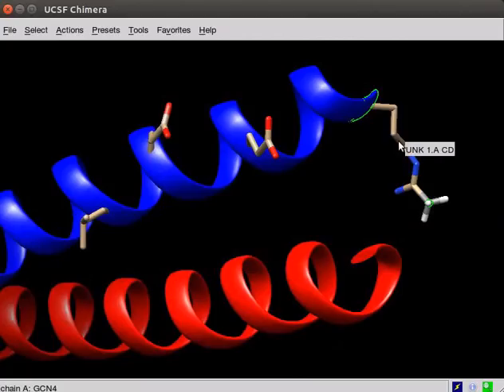Hover the cursor over the bond you want to rotate. Information regarding the bond appears in the atom spec balloon. To select a bond, place the cursor on the bond. Press and hold the Control key. Click the left mouse button. The selected bond is now highlighted.